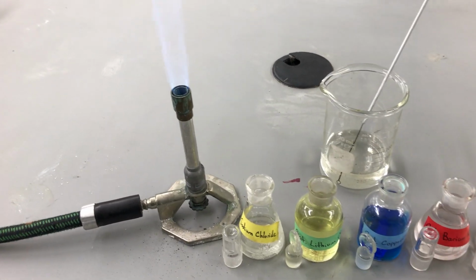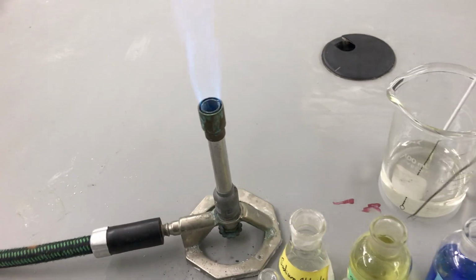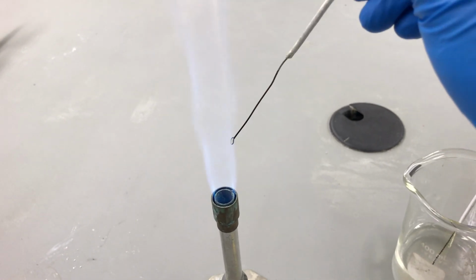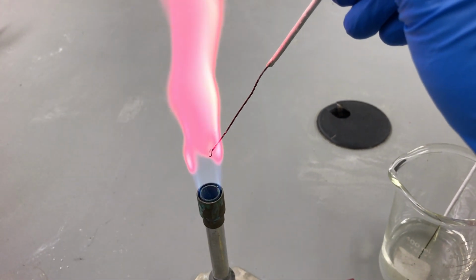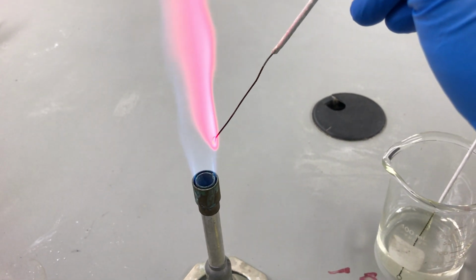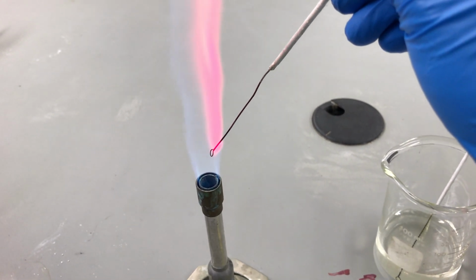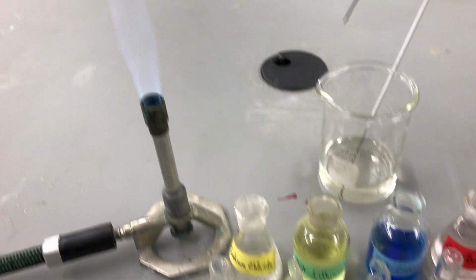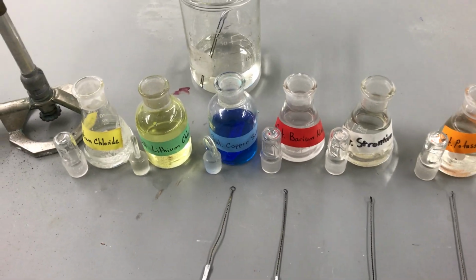Next up, we're going to test our lithium chloride. Once again, we're just going to introduce our flaming loop to the liquid, coming in at about the side. And what we're seeing this time with the lithium is kind of a purpley red, very lovely color, reddish purple, very, very distinctive. So we will mark down our lithium chloride as reddish purple on our data sheets. This is on table 2.